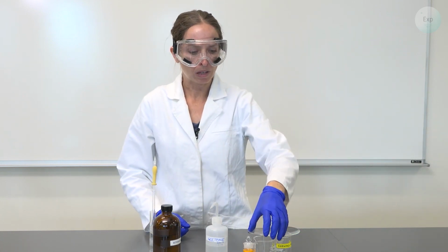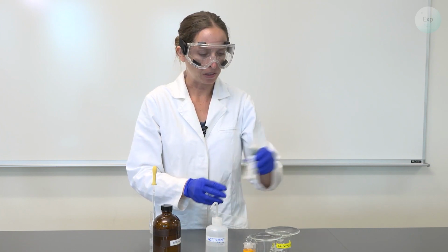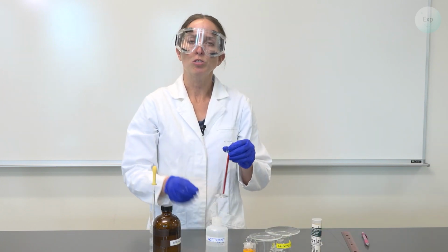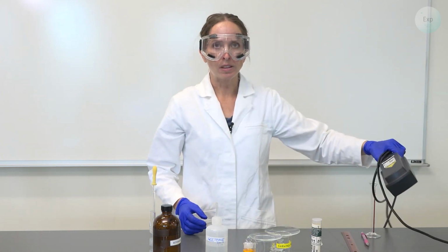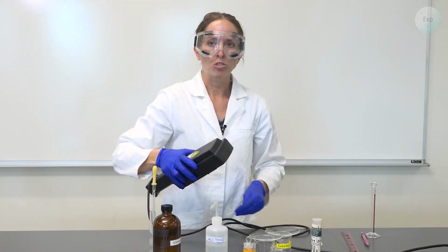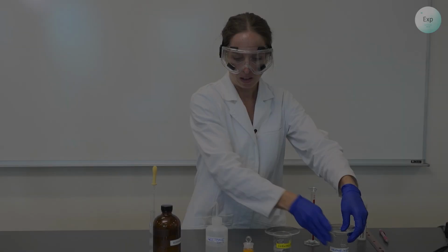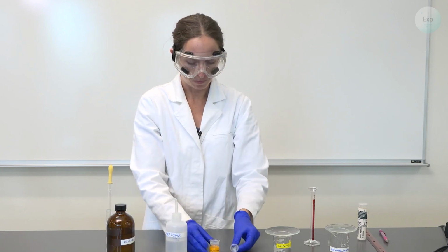a watch glass to keep that beaker covered, some capillary tubes to spot our sample on the TLC plate, a pencil and ruler to mark our TLC plate, a 10 milliliter graduated cylinder to mix our TLC solvent, and finally, a UV lamp, by using which the fluorescent dye in the TLC plate will help us see where the sample spots have ended up. To start, I am going to dissolve the caffeine using some acetone.